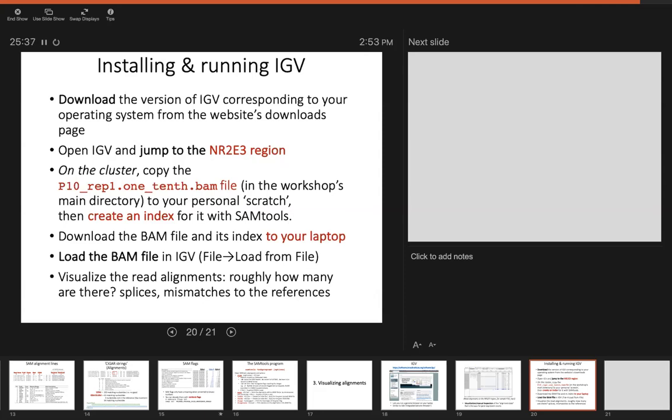Questions? Or, yes? Can you just demonstrate? For the install, or how do I compare? Yeah. Which part? Just the size of the genome. Which? Because we only have 30 minutes left. Yes.